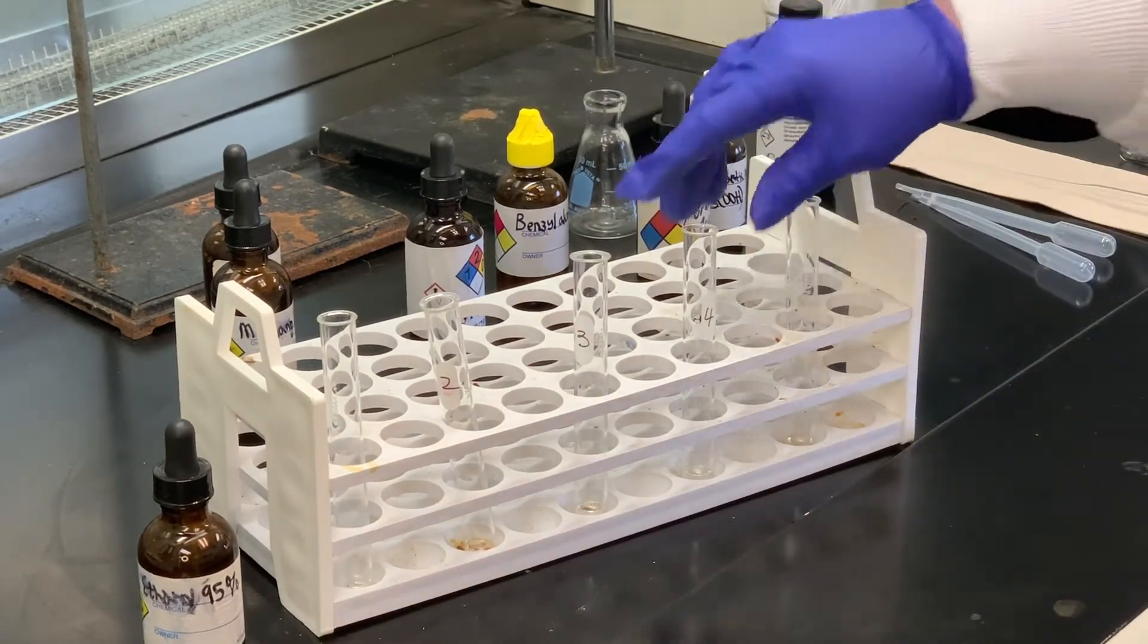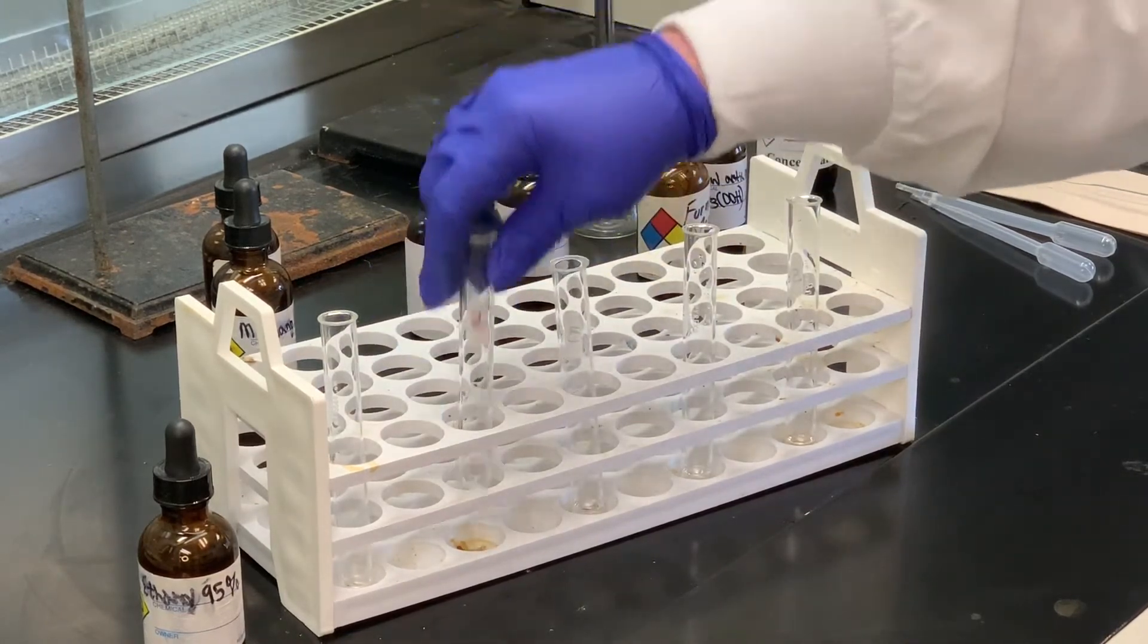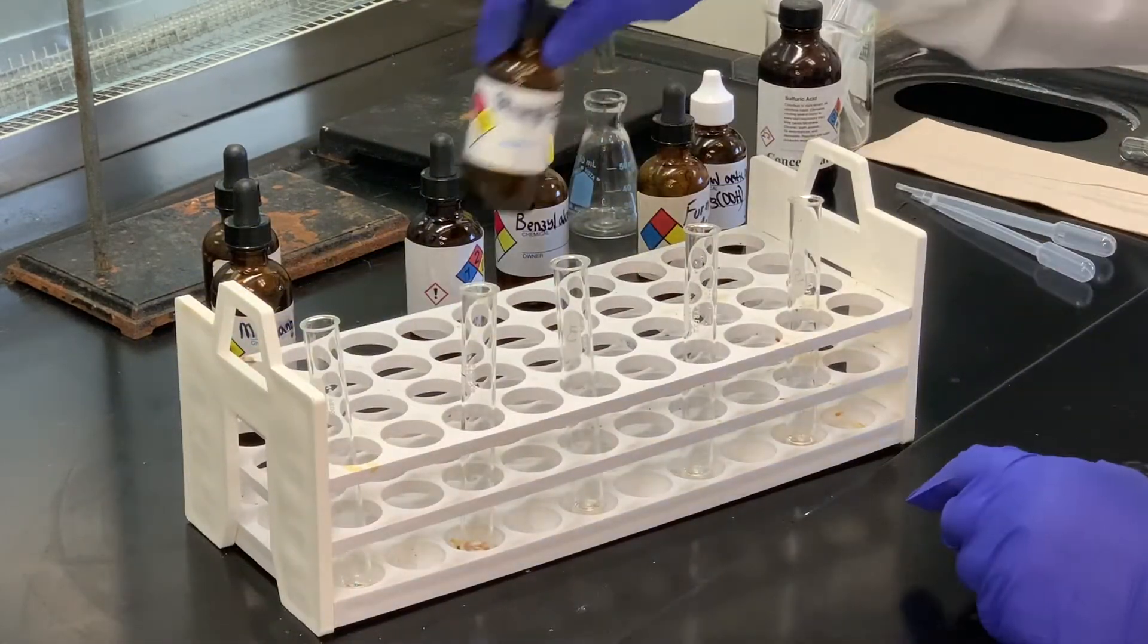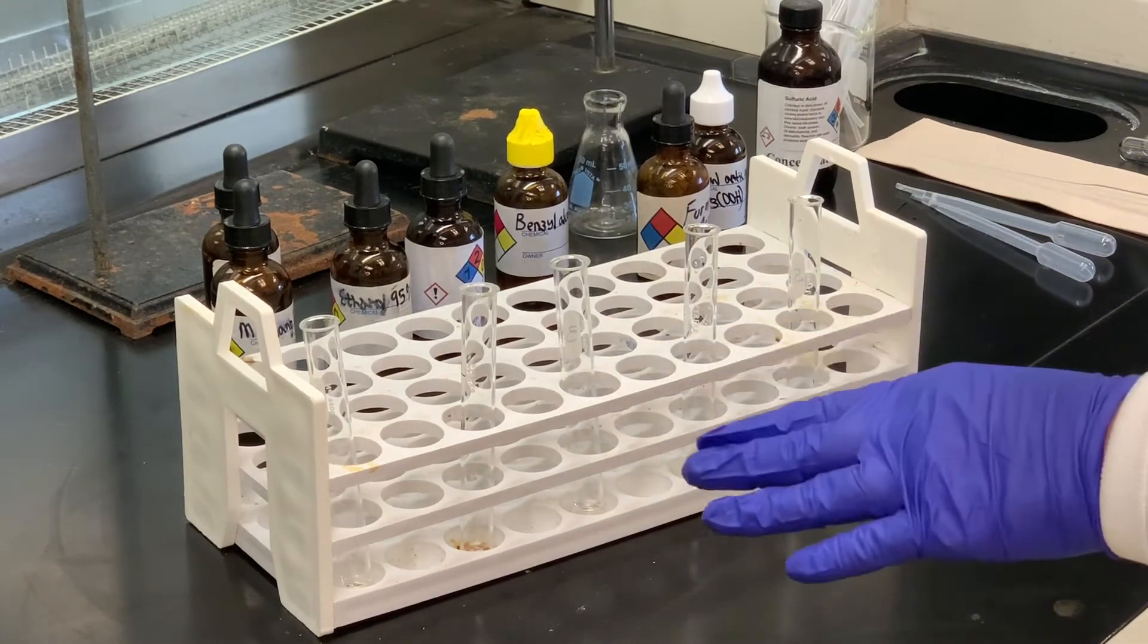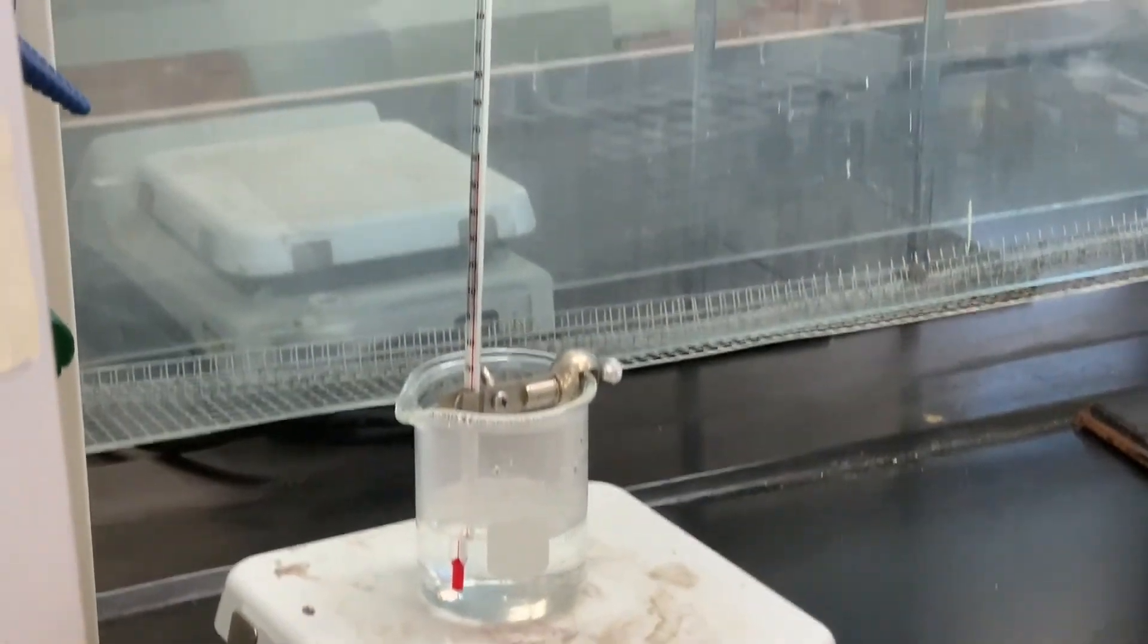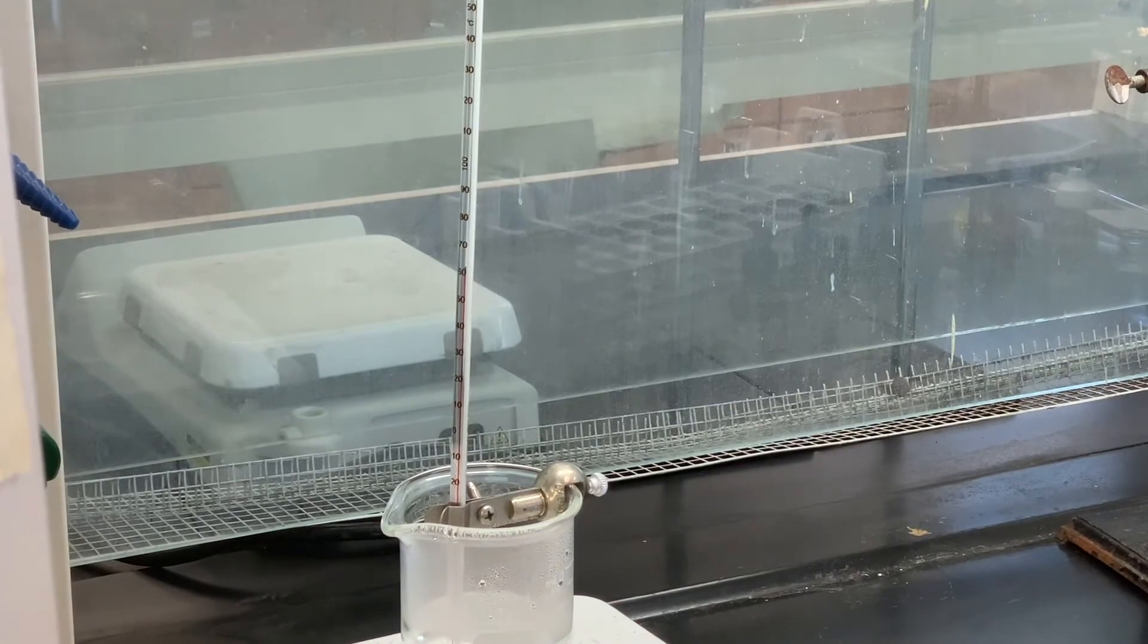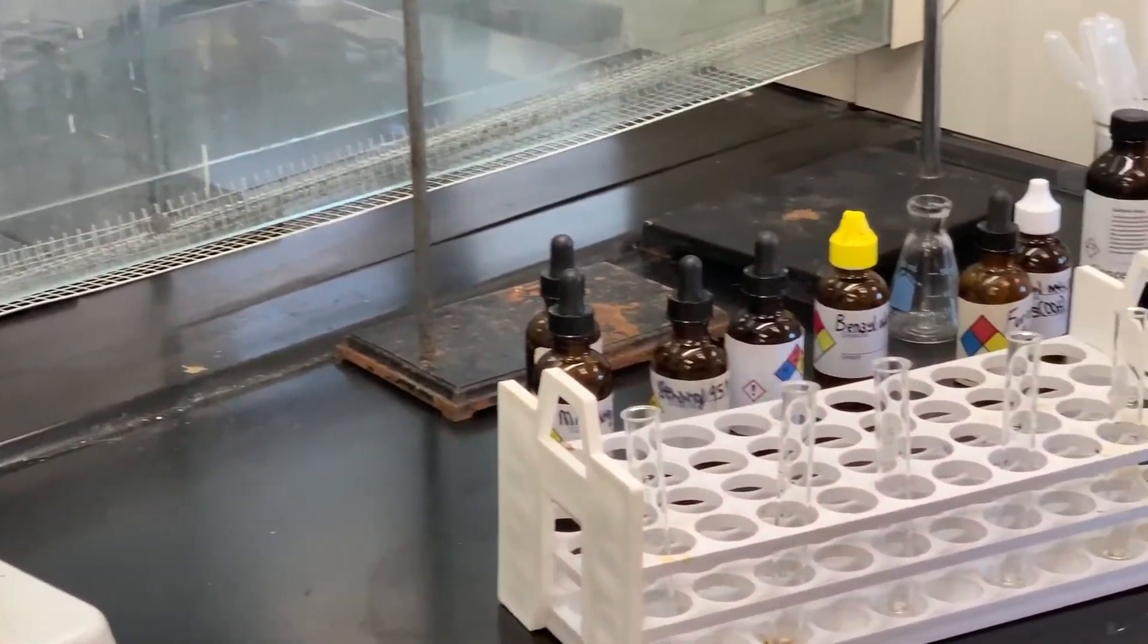Now when you mix an alcohol and a carboxylic acid together, nothing's really going to happen until you add an acid catalyst. So our acid catalyst is sulfuric acid. So what I need to do is to add 5 drops of sulfuric acid to each of these test tubes. Once that's done, we're going to place it in a hot water bath or warm water bath where the temperature is around 60, 65 degrees. And then we will let them sit in there for about 10 minutes. And then we'll take those out and see if we can notice a certain smell associated with those.